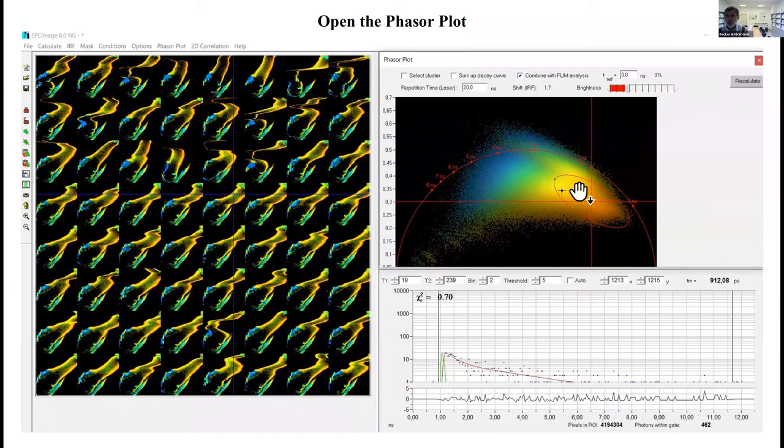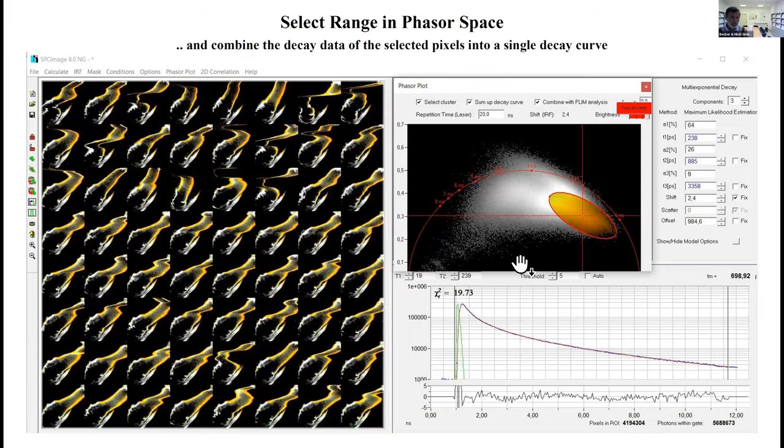Back-annotate them and we see we selected the leg. That's good. We combine the photons in all these individual images of the water flea leg, and we get a fluorescence decay which contains almost six million photons. This can be analyzed at extremely high precision.